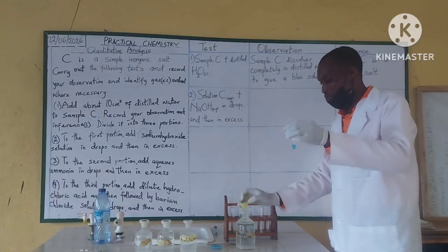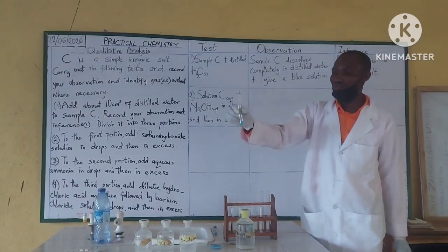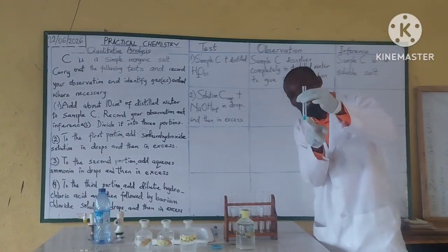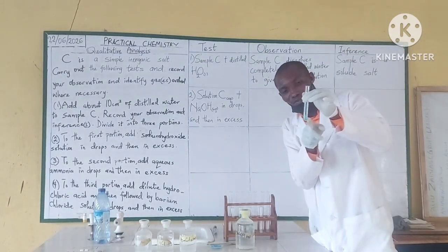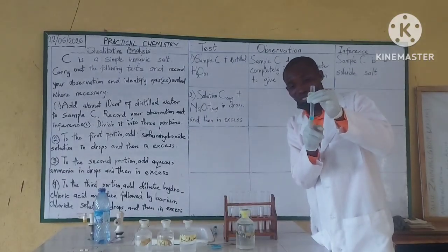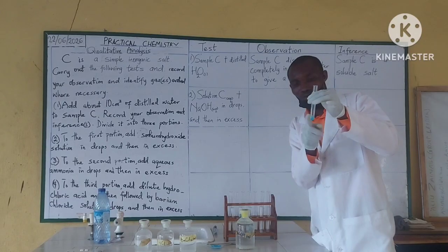In drops, you can see that there is a kind of colloid being formed inside that solution. The thing is not clear, just like a cloud.